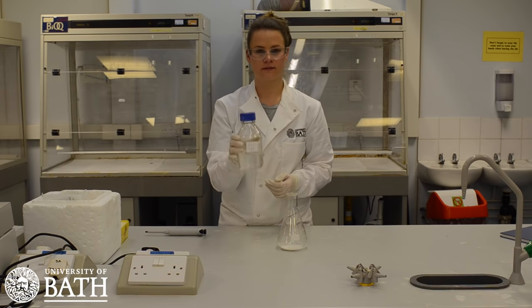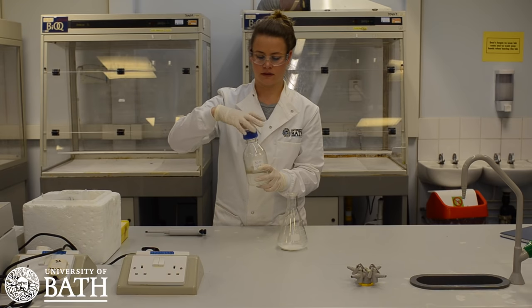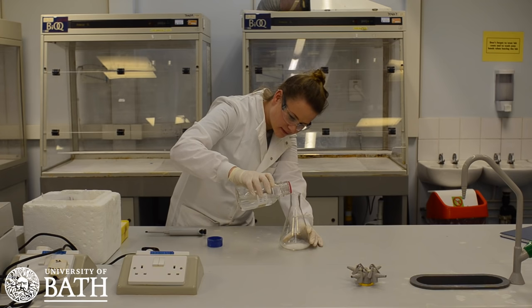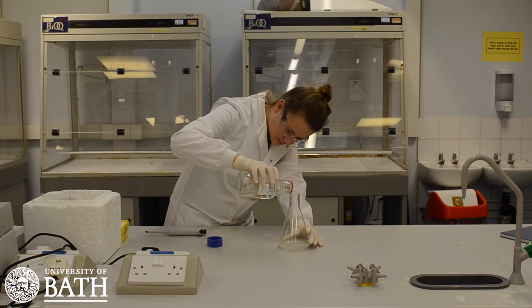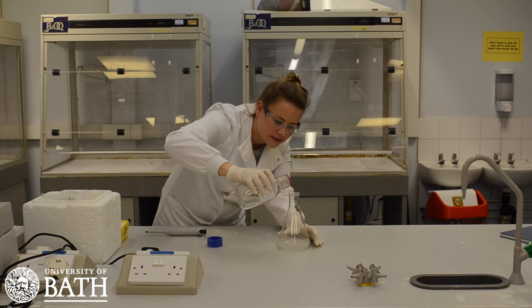Next you will need to create an agarose gel. This may have been done for you, and if so you can skip to a later point in the video. Take your 1x TAE buffer and mix it with some agarose powder. In this example, 2g of agarose has been used with 200ml of TAE 1x buffer solution.